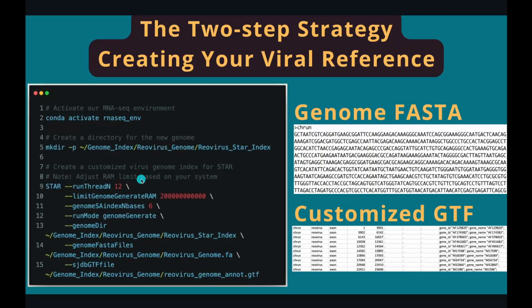To create the STAR index, we need two input files: a genome sequence file in a FASTA format, and a customized genome annotation file, the GTF file. For the GTF file, here's the table, a tab-delimited table with 9 columns. You can make this table manually or programmatically.